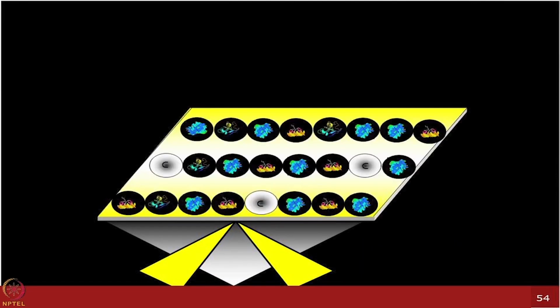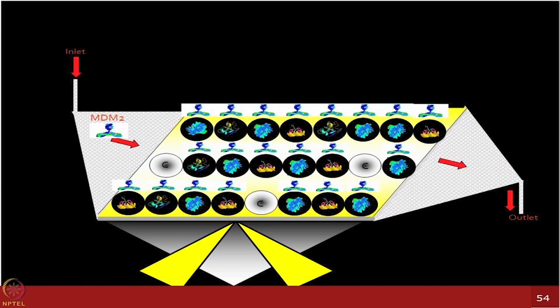The next experiment which was planned was more of a high throughput experiment, and it was very challenging to do on the prototypes we had available. One of the companies in Cambridge at that time gave us a lot of clones of p53 mutants. These are all hotspot mutants of different p53 regions, to test how the MDM2 protein binds to wild type p53 versus different mutant forms of it.